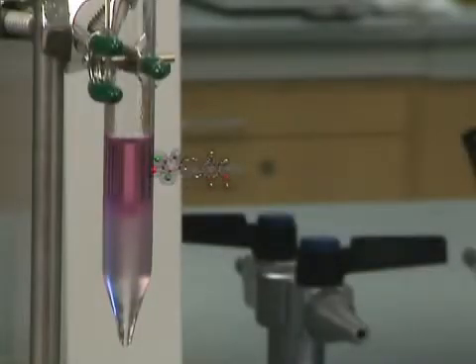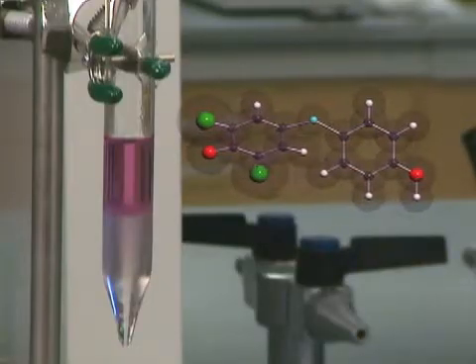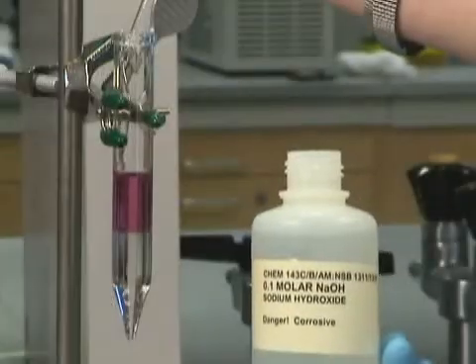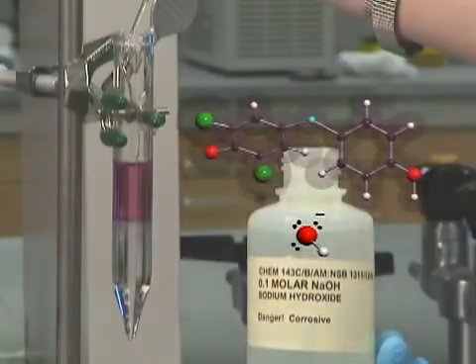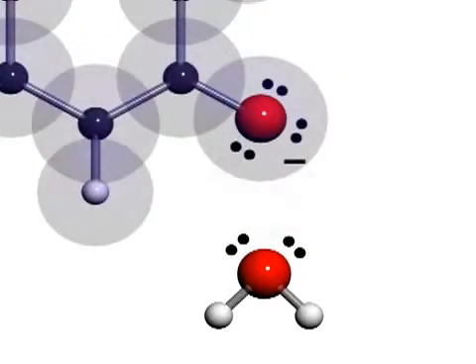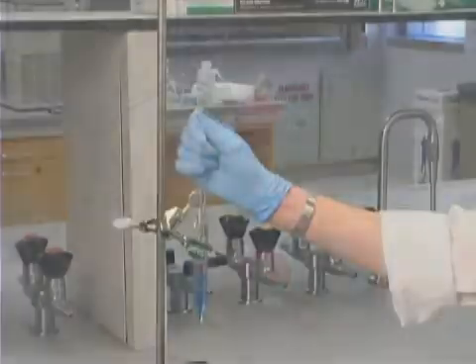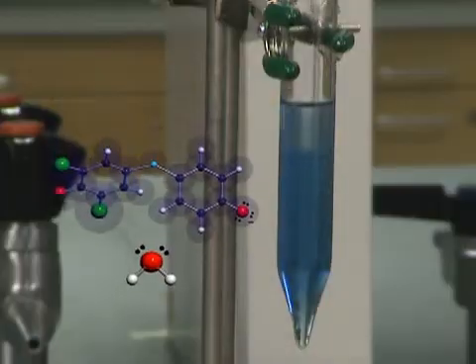You can move a compound between organic and aqueous layers by changing the protonation state. The top layer contains a pink indicator. Adding base removes a proton from the indicator. The deprotonated molecule is now blue and is soluble in the bottom aqueous layer.